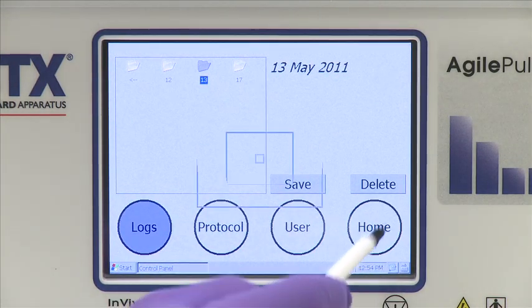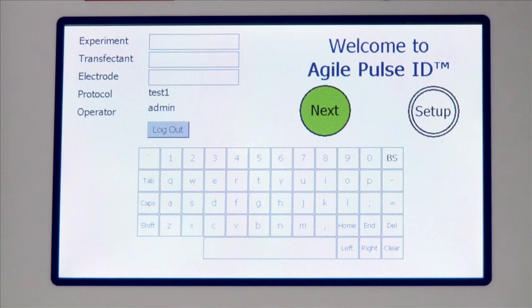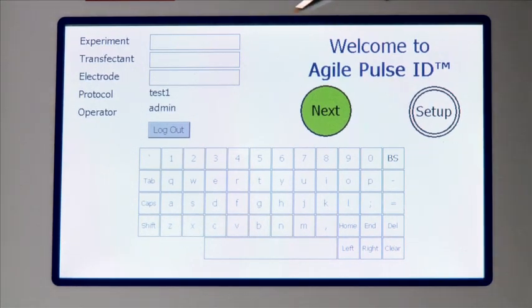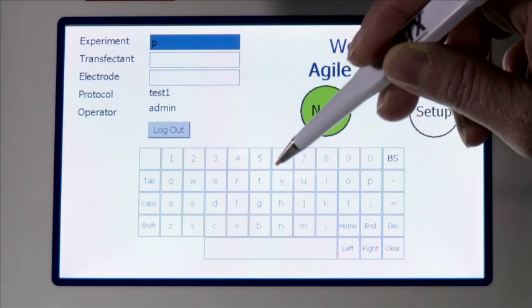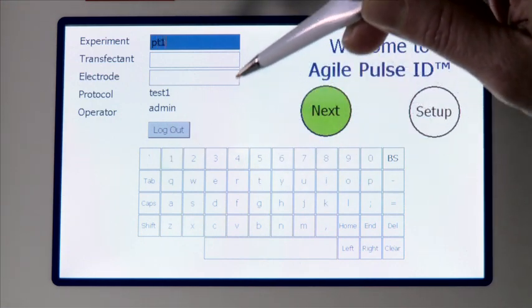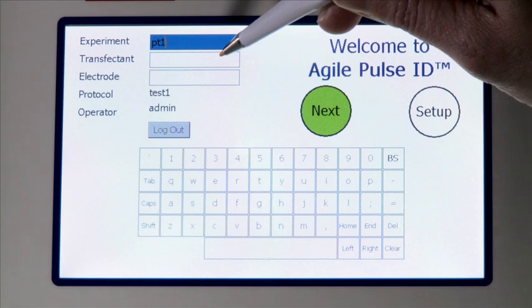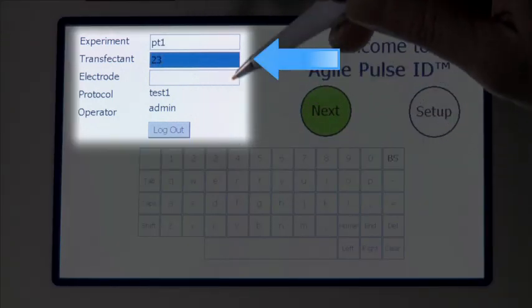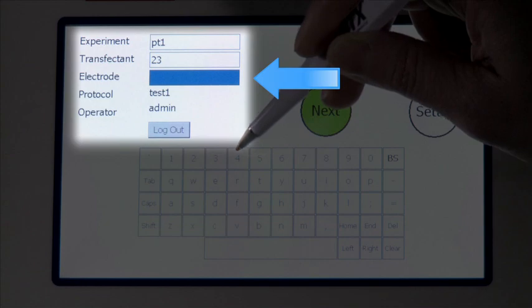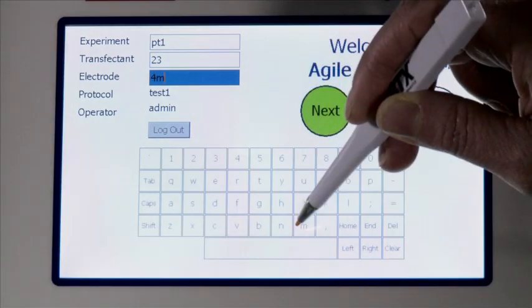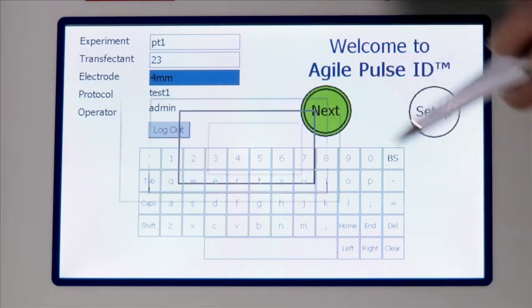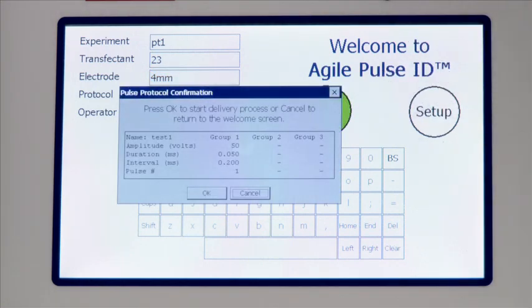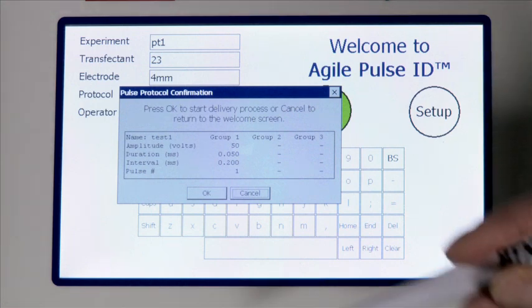Click on Home. An opening screen allows input of experiment name for the current therapeutic or vaccine delivery, and information is entered by a virtual keypad. Touching a text field box highlights it blue and allows modification. The therapeutic field permits the name of the drug or vaccine, and the electrode field is to record the type of electrode used. Once all information is entered, click on Next. The protocol parameter screen pops up and allows you to review the protocol that will be delivered. Once the parameters are verified, click on OK.